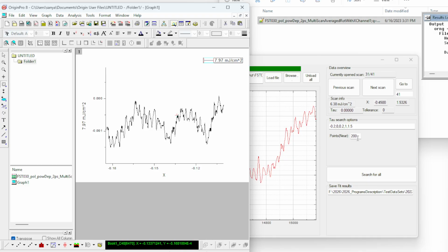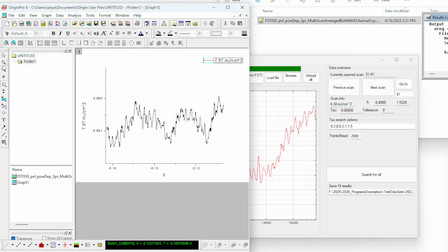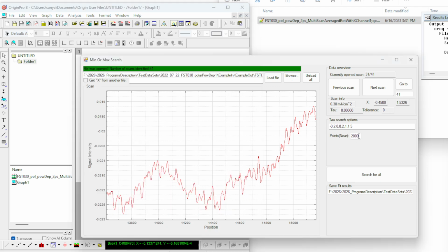So for this reason we do not average over a vast time, so it's fine in this approximation. If I choose less, then the data will be noisier. If I choose more, for example, 2000 points, it means that right now I'm averaging over a bigger area. So it's not exactly a cross section, it's more like some averaged response.